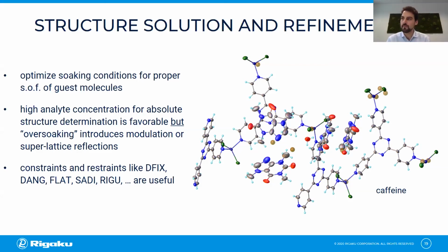Okay, good. I think that's, oh, there's more coming in. Are there restrictions on the guest molecule besides the volume? Can it maybe react with the sponge? Yes, for sure. When you synthesize the crystal sponge, you employ a solvent mixture of chloroform and methanol.